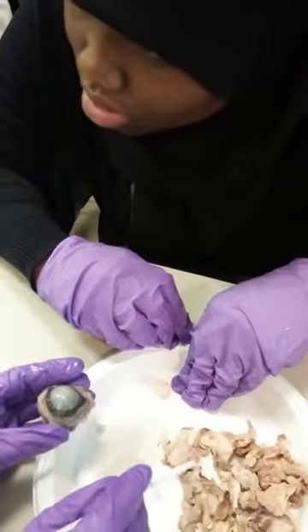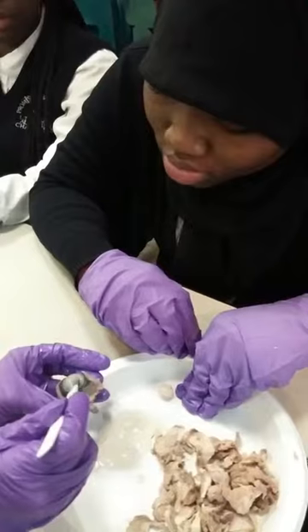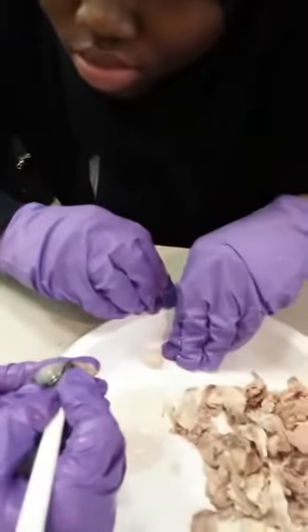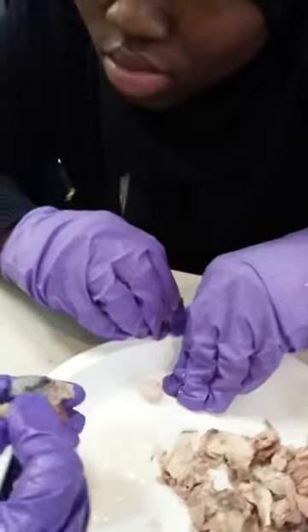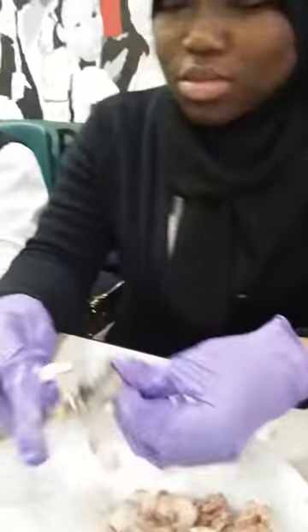Now what I want you to try, this is tricky. Take your scalpel, cut the cornea off. This white part, you may have to come at it sideways like this and give little cuts like this. And go around the circle and just cut it off. Okay, so give that a try. So you want to try to cut that cornea off.